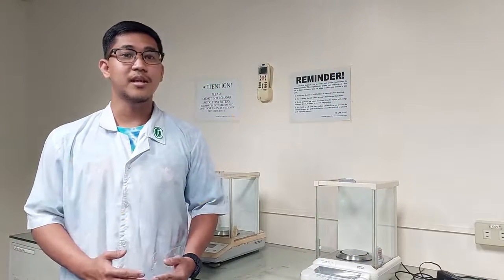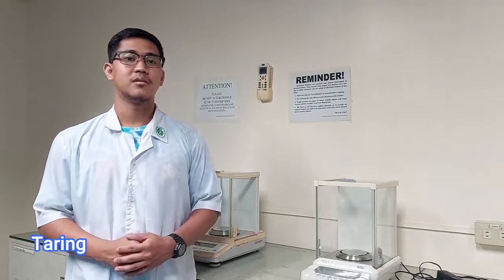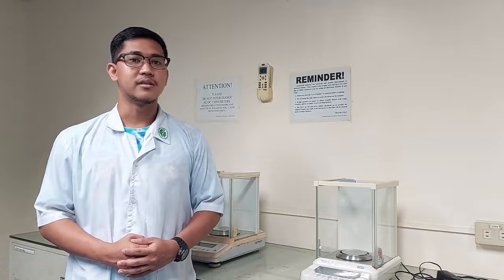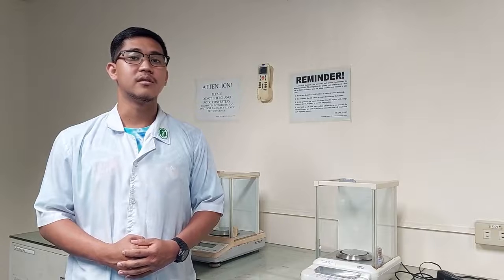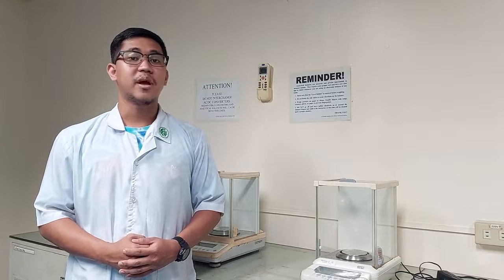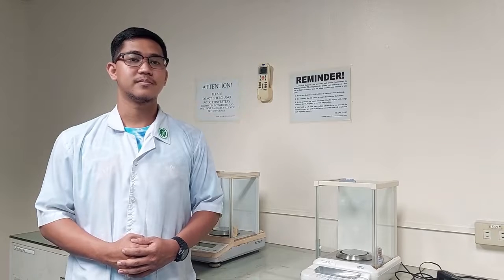A common step that is observed when weighing in electronic balances is taring. By taring a balance, the process of weighing by difference is done automatically. When a balance is tared with an object on the balance pan, the weight of the object will be automatically subtracted from every reading until the balance is tared or zeroed again.